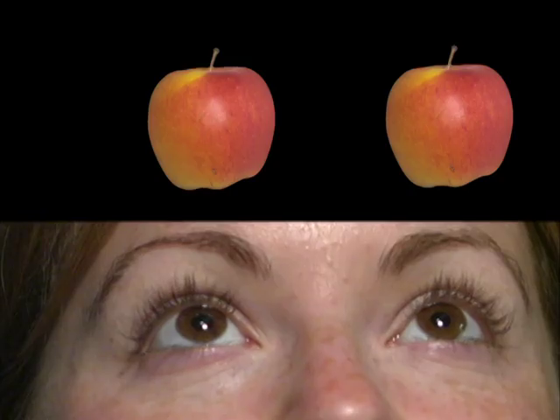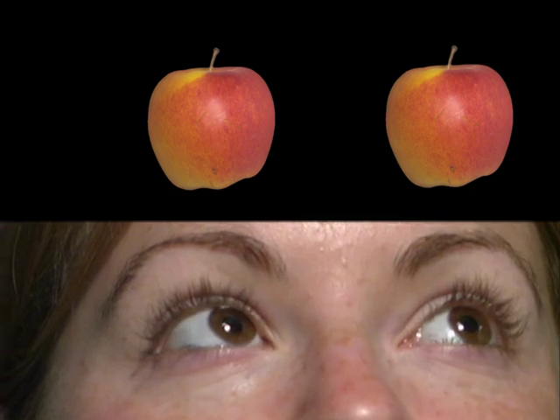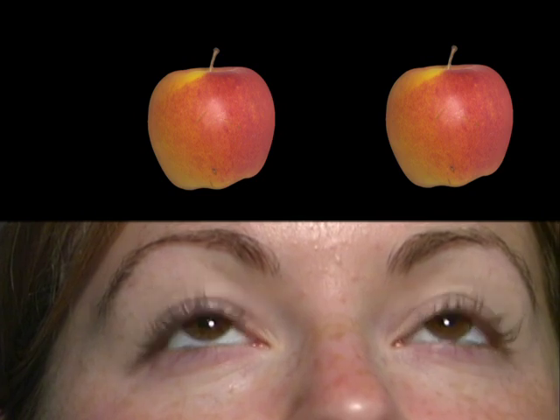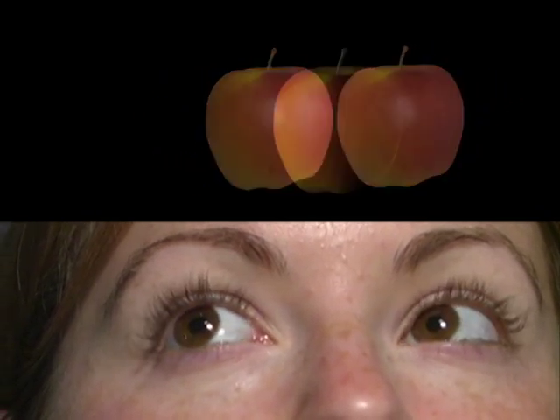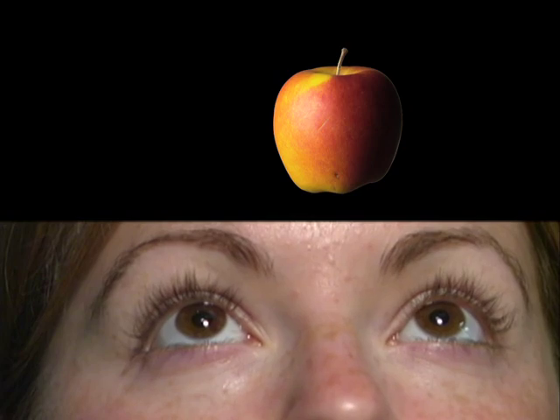To perceive an object in three dimensions, you must see two images, one in each eye. Also, each image must be viewed at a slightly different angle. Your brain then merges these two images into one image that has depth.